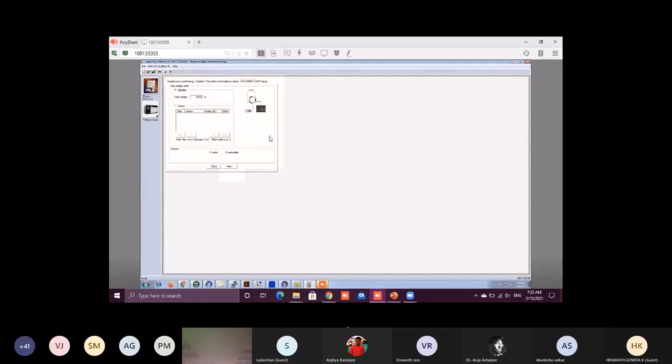This is the autosampler position, where you can see what samples are placed and at what position. And this is the Easy-Nano spray, from where the nozzle will spray.